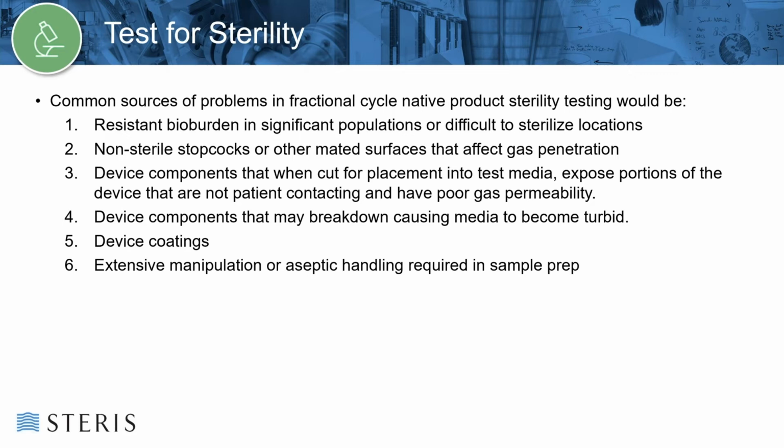We can perform the test of sterility by cutting up or disassembling the product aseptically in a laminar flow hood. The device is placed into a liquid growth media and incubated for a minimum of 14 days. Alternatively, the product could be extracted similar to a bioburden test, with the extract filtered and the filter placed into liquid media and incubated for a minimum of 14 days.